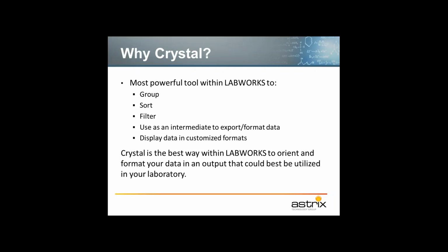But Crystal is indeed the best way within LabWorks to orient and format that data in an output that can best be utilized in your laboratory. And as you'll see, and as you know, dealing with Crystal, this does come at a cost. You have to be somewhat trained in Crystal. It's not really that intuitive to design a report off the bat, but with a little bit of experimentation and playing around, you can become experts in no time. If we do this webinar a year from now, 50% of you will be experts easily.